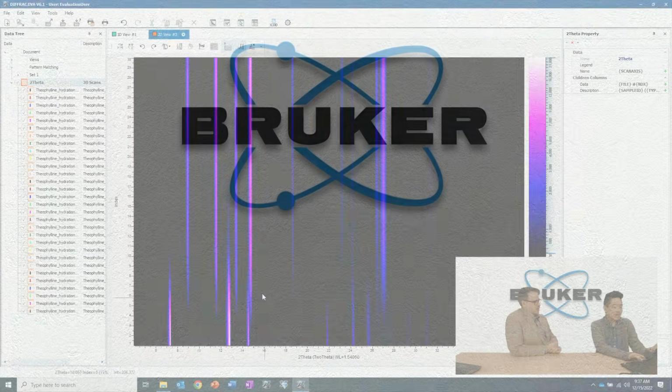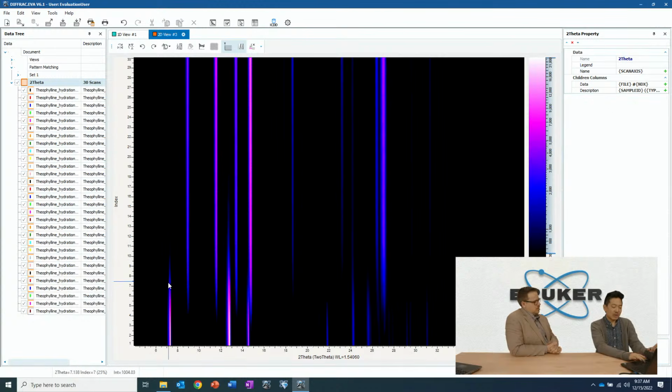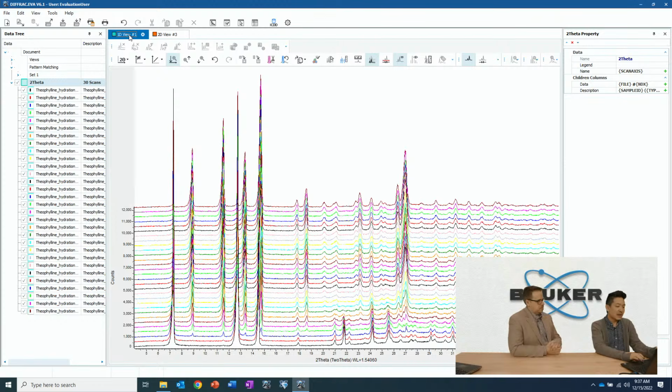So with all of this, one of the things I thought was kind of cool about this particular one is looking at this intermediate region, where you start to see these transitions. One of the more interesting capabilities of EVA that you mentioned earlier is this clustering, or selection over families. So, statistical analysis of data.